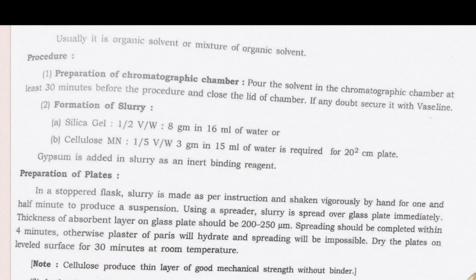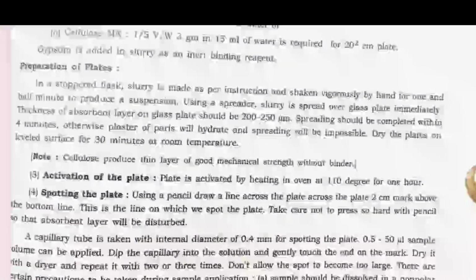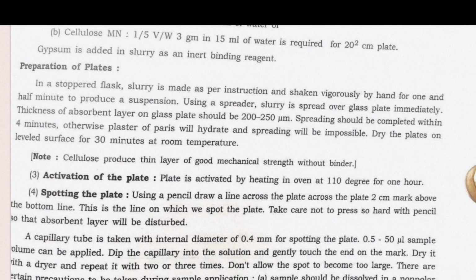Preparation of plates. In a stoppered flask, slurry is made as per instruction and shaken vigorously by hand for 1.5 minutes to produce a suspension.